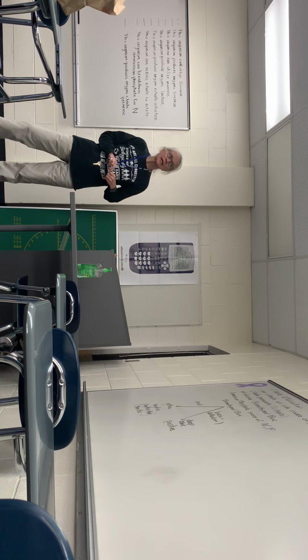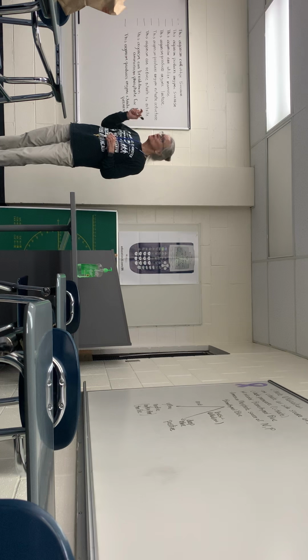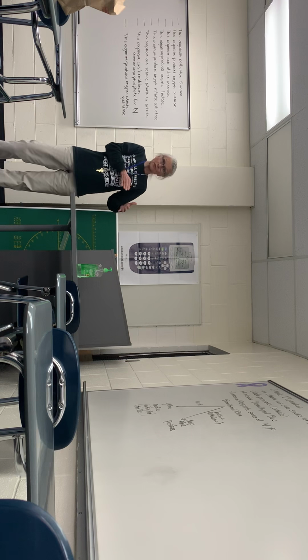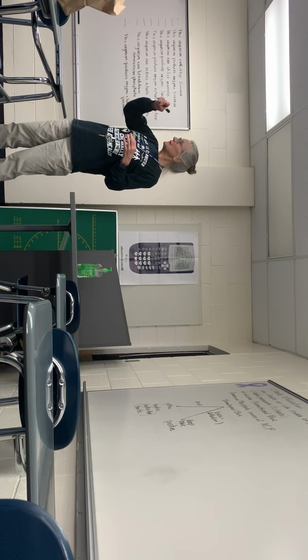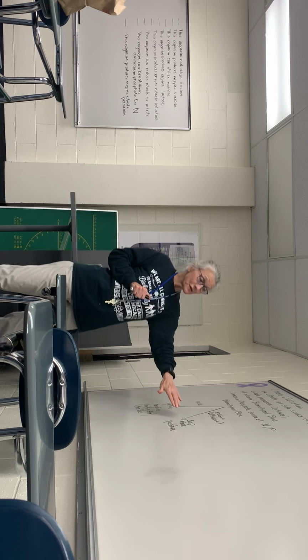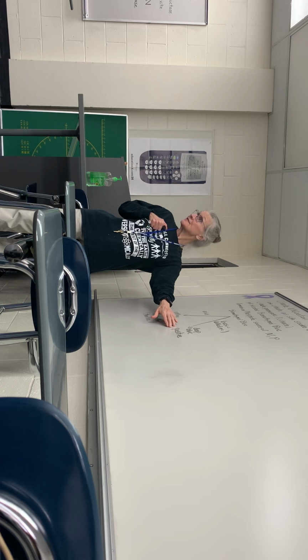The pH indicator in this one is bromothymol blue, and that turns blue under alkaline conditions. And it stays green around neutral, and it turns yellow under acid conditions. So this is the one that turned the real pretty peacock blue. Y'all remember the one that was on a slant? Okay, so that's the citrate test. So if you see that deep blue color, that's a positive.